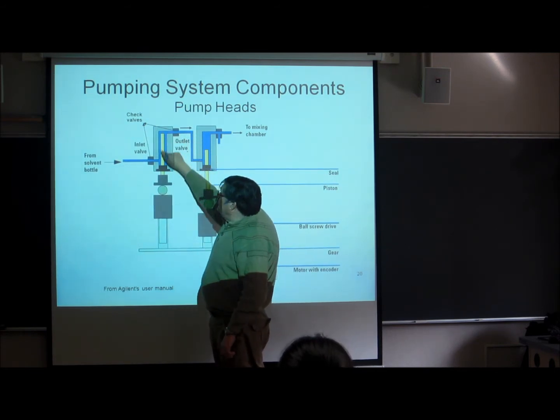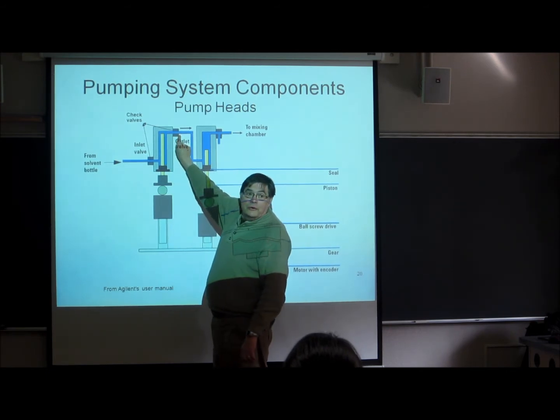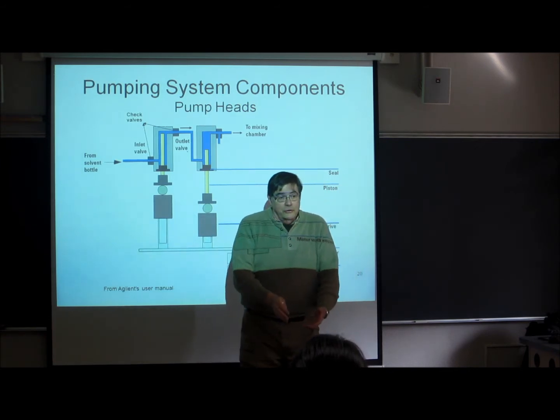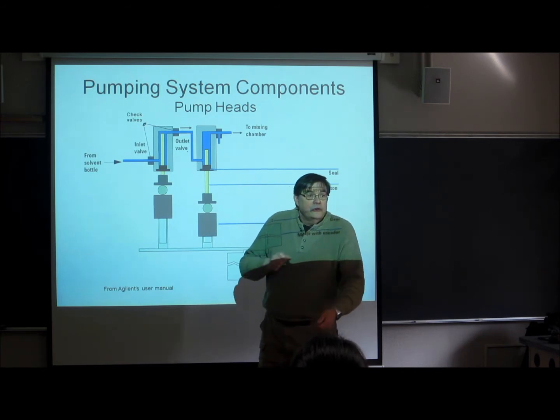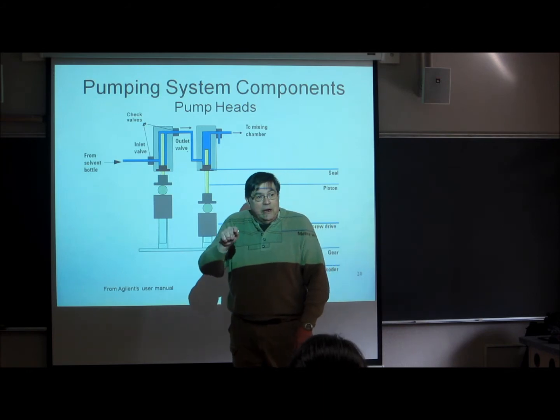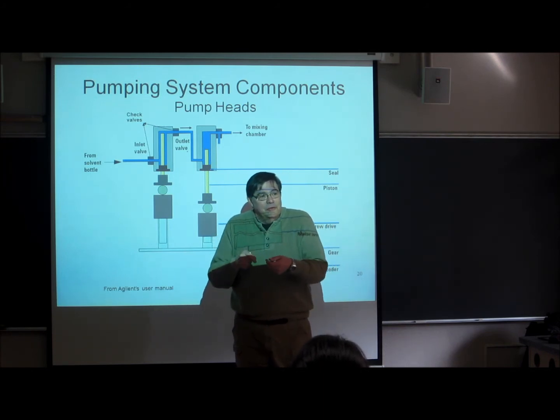And then when you pull this down, what happens? You no longer push out, do you? So your experiment, which is pushing the solvent through the stationary phase, is interrupted by the withdrawal of the piston. So you separate for a while and then you stop, and separate for a while and then you stop. So it's like a quicker syringe kind of pump.